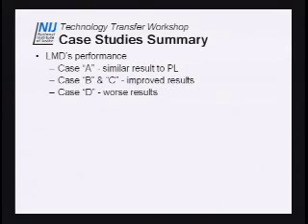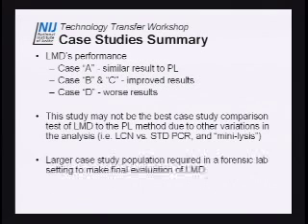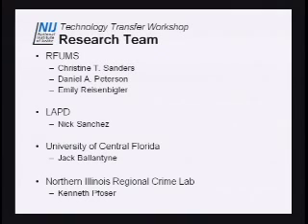So I'm somewhat satisfied, considering this was the first time we even attempted casework, that LMD can be used to improve casework. And I'm hoping that Louisiana is going to eventually do more case studies and see what types of cases are best suited for this type of analysis. And again, I wrote this to remind you that I did alter the protocol compared to what you did in the lab. We did that mini lysis step to get improved results. And a larger case study population is obviously needed for validation.